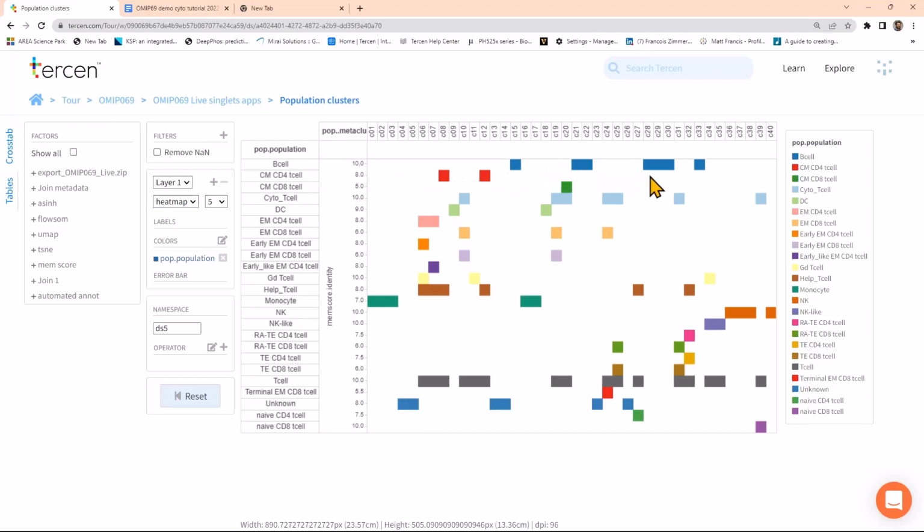You can see that B cell is composed of multiple clusters. This is based on an algorithm that has gone through each cluster and given an immunophenotype name to it in such a way that it makes more sense and starts indicating to the scientists which clusters belong to what immunophenotype.